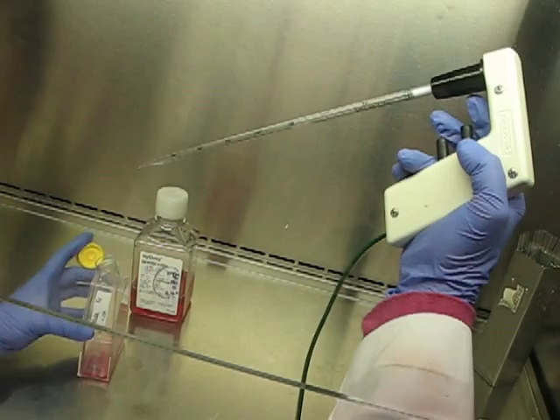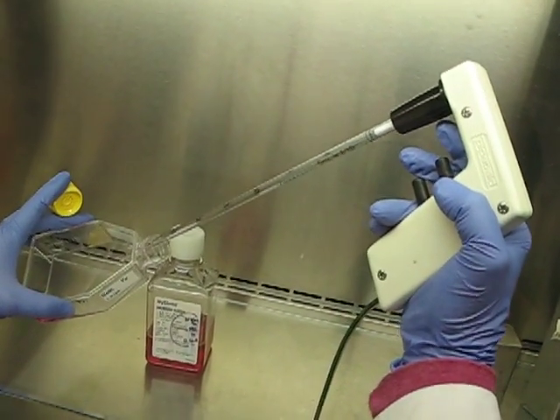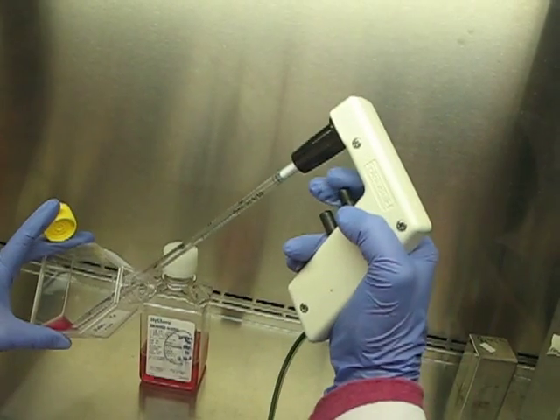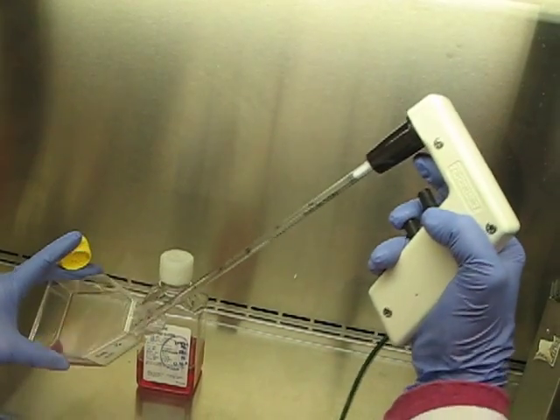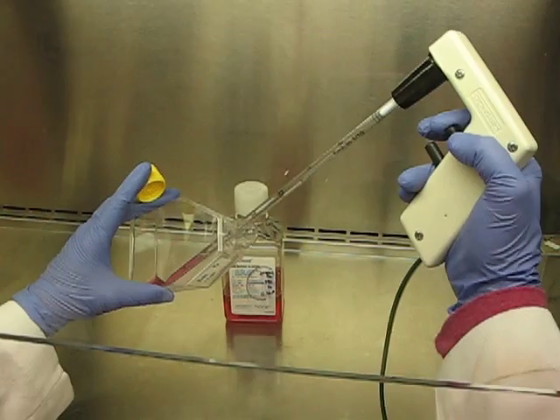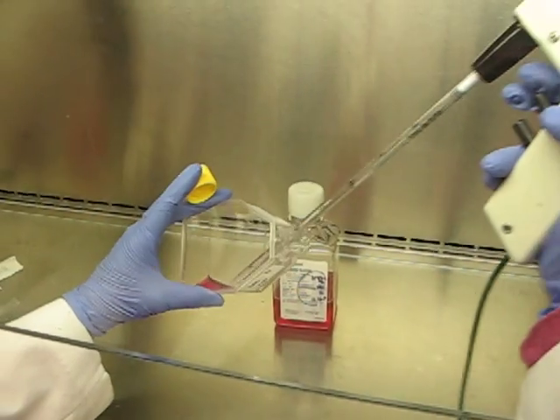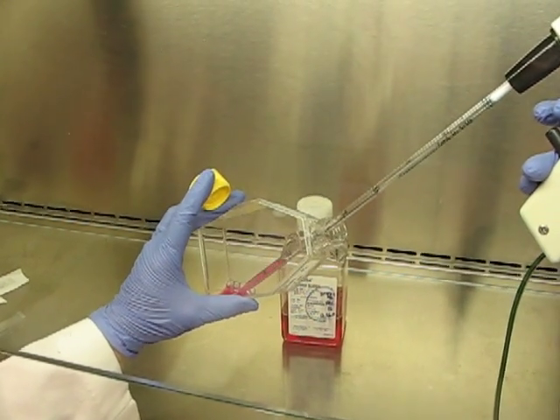And you add it down the side. Now you still have some cells way up here in your flask, you have them all across the surface. You need to wash them down, so you suck up all that media and you gently squirt it out into all the corners to wash down all the cells into the corner. Now I pipette up and down.